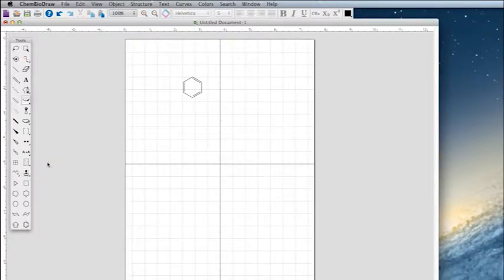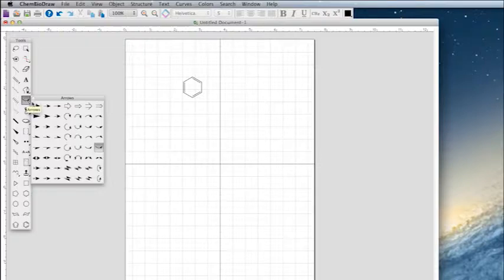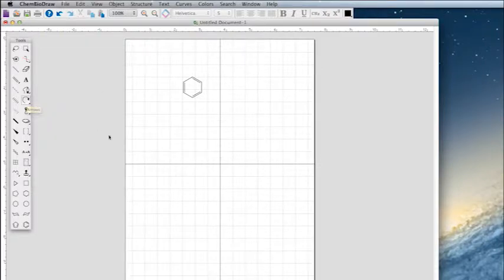Remember, you must keep holding the clicker on your mouse when navigating these extra features, because once you let go, the program will take the last place your cursor was on as the function you wish to use. The lasso or marquee function is an excellent tool to select specific structures. Selecting chemical structures will allow you to resize these structures if you'd like, and also change its color or font using the toolbar on top.